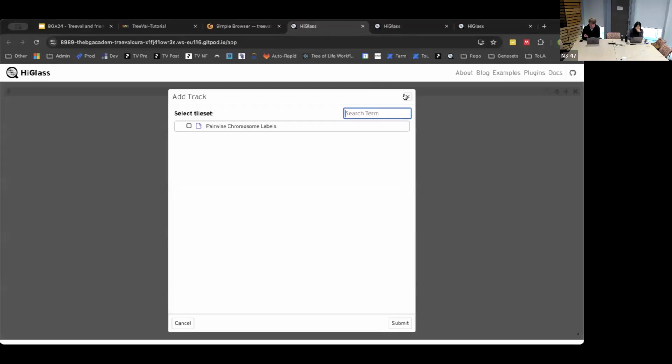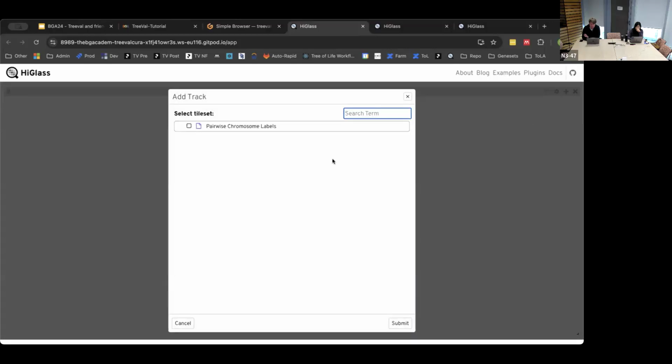It's finished loading. When it's finished loading, press the plus, center, and then it'll take a moment, but it should identify and find the available files maps here. Here we go. So you want the map and the genome track.